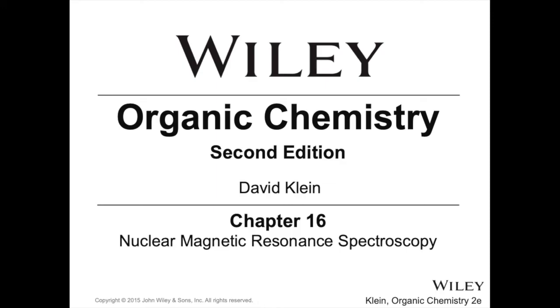In this chapter, we're going to look at NMR, or nuclear magnetic resonance. Now, out of all the analytical techniques you're going to come across in this course, NMR is probably the most useful to any organic chemist. If you continue on into organic chemistry research, especially synthetic organic chemistry, you're probably going to use NMR on a daily basis.